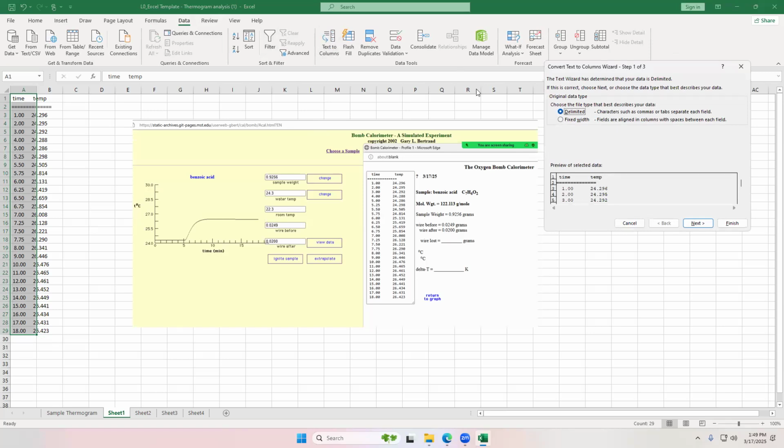And you'll notice the numbers in the columns are separated by spaces. So your delimiter, okay, the character that separates the columns, is spaces, right? The spaces between the columns. So you use the delimiter as a basis for splitting your column.